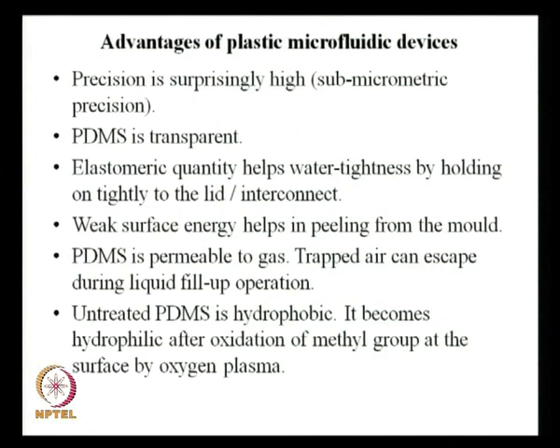Now, I would like to quickly summarize the advantages of plastic microfluidic devices. Here the precision is surprisingly high, sub-micrometric precision. See, the way we are talking about it, as if we are borrowing a technique which has been there for ages, that you have a negative replica and then you are pouring it or putting it, the way I am presenting it, as if we are making an idol out of clay. It is that way, it is that simple.